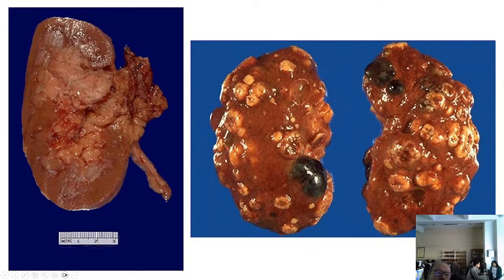Here is another neoplasm. It either invades the renal pelvis here, you see, all this granularity. The mucosa is not whitish as we previously saw and flat. It is of granular consistency. So it is either a tumor of the kidney invading the renal pelvis, or it is a tumor of the renal pelvis itself. In the latter case, how will you call it? How will you call a tumor that rises from the renal pelvis of the kidney?